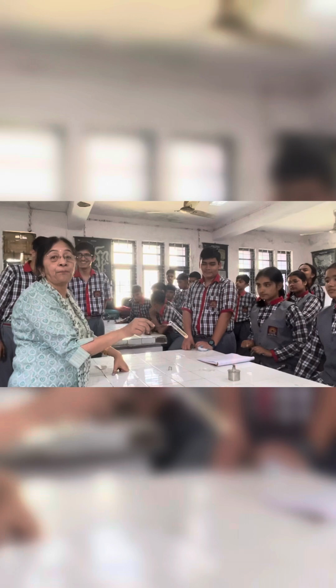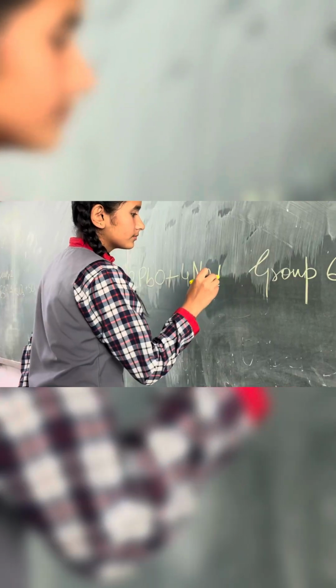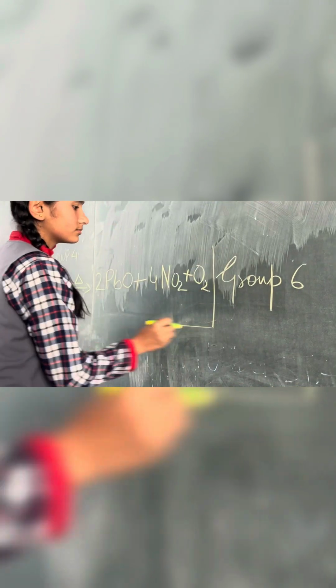Lead nitrate is decomposed to lead oxide, and brown fumes of nitrogen dioxide can be seen. Okay? Yes. Again, why is this a decomposition reaction? Because one compound is getting split into many others.